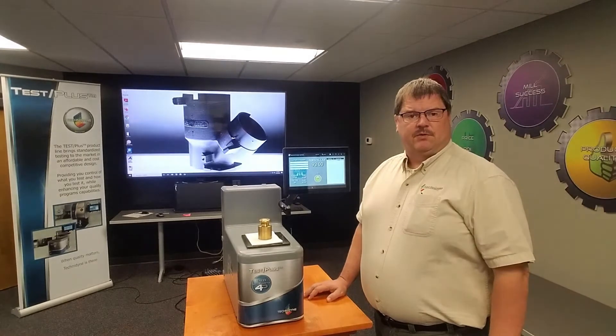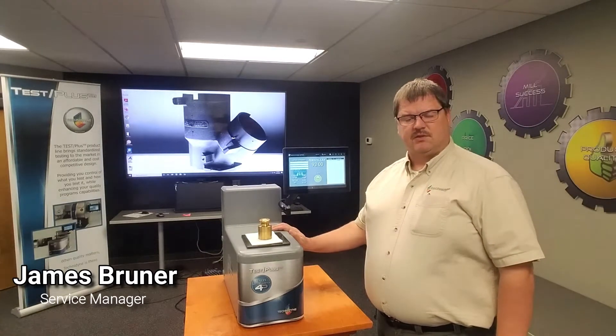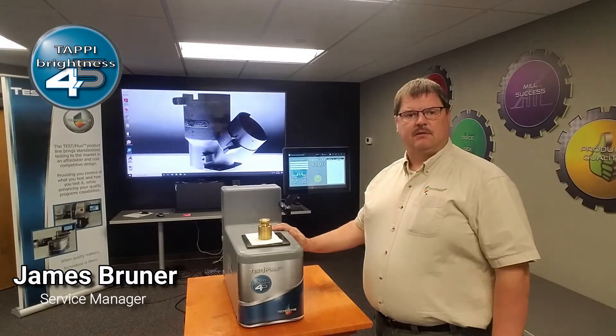Hello and welcome to Technidyne's Virtual Trade Show. Today I'm here to introduce another of our Test Plus instruments. This is the TAPPI 45-degree brightness meter.